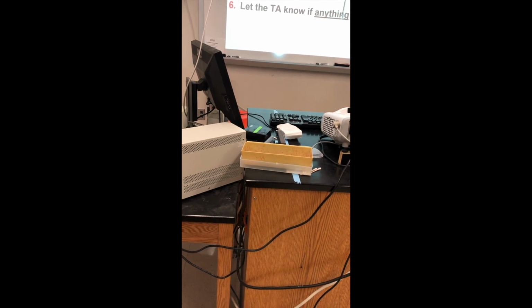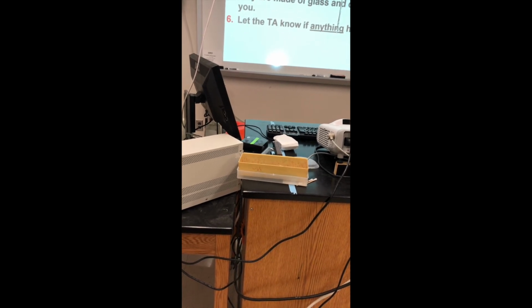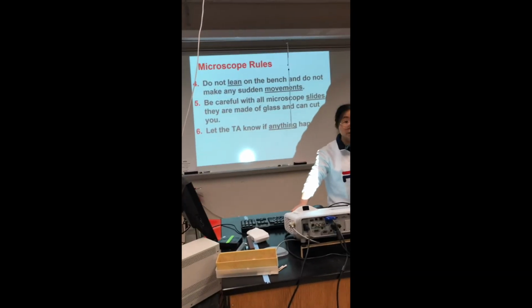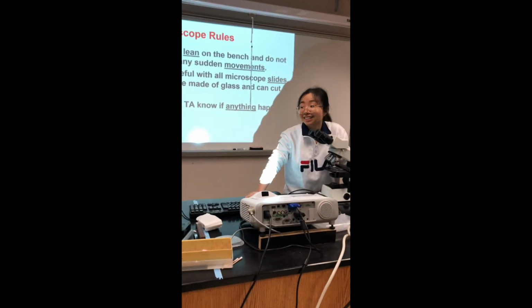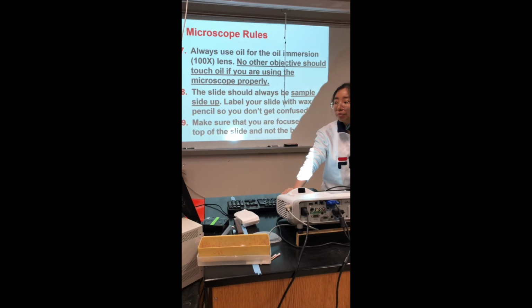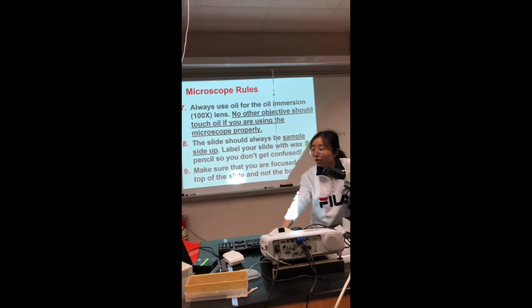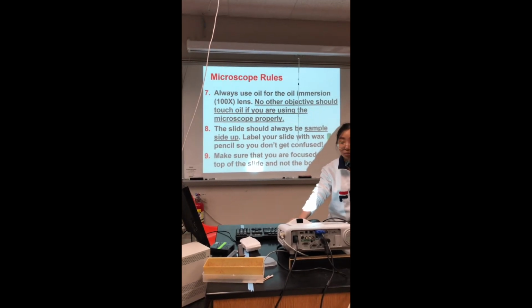Be careful with all microscope slides. They are made of glass. You don't want to break yourself. And if you have any questions, ask your TA. Always use oil for the oil immersion lens. No other objective lenses should touch oil if you are using the microscope properly.